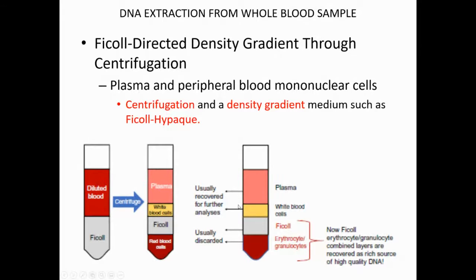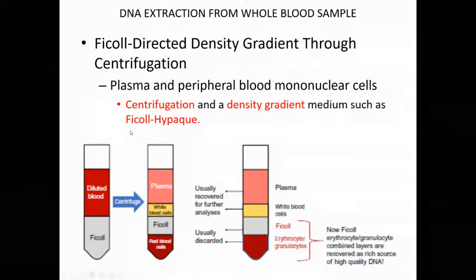So basically, for example, for the white blood cell, the platelets can be separated from the mononuclear cell by centrifugation through a fetal bovine serum cushion gradient. And then after the centrifugation, the supernatant containing the platelet is discarded, and then the peripheral blood mononuclear cell can be collected for the DNA purification. So that's how you purify the DNA from the blood.